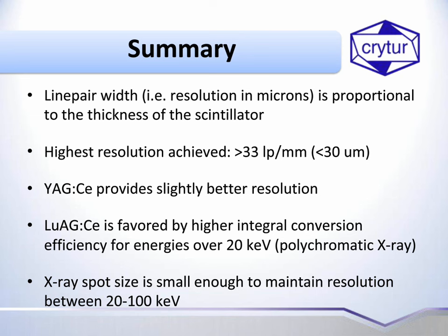What type of cooling does the camera use? The camera is effectively a Peltier cooler, and it just uses air cooling. Sorry, let me try it again. The camera is Peltier cooled and uses air cooling, so it's cooled effectively by a fan and reaches a cooling temperature to be thermally stable.